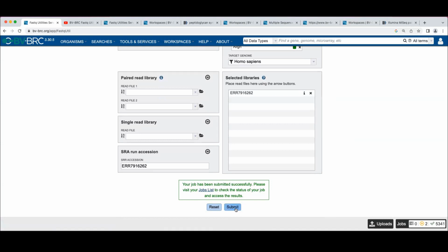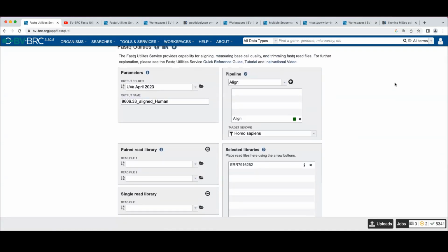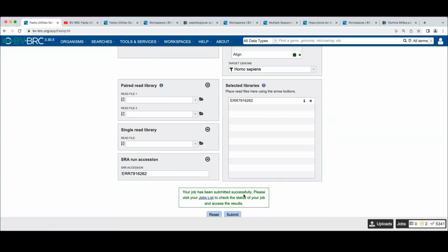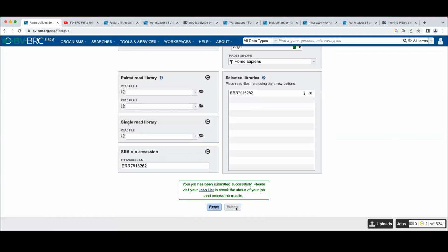Are you all with me? I don't see you guys submitting your own jobs. And to do the next steps, this is the most important one. So I need you to get your little fingers going, or you're going to be very sad when we go to the next steps, because you won't have the reads you need. So we submit that. So now we've got 3 jobs running.